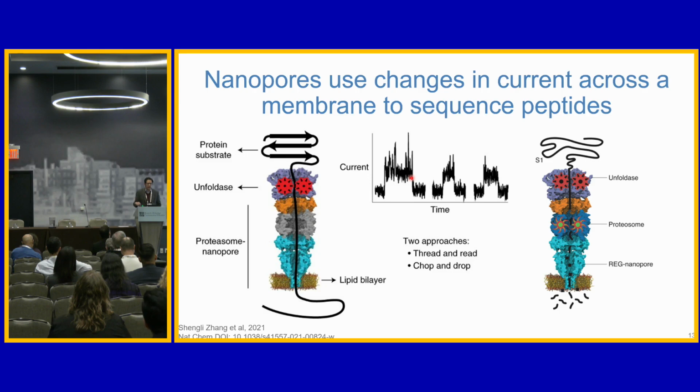So this is one solution for this type of work. This is actually a really hard problem because unlike nucleic acids, which have very simple constrained space and functional groups, it's much more complicated to pass amino acids through something like this and get a meaningful result, because the amino acids before and after change the physical chemical properties of the amino acid that's currently being passed through. This is a strategy that I'm sure is long-term going to work because of AI, but currently it doesn't work at this stage.